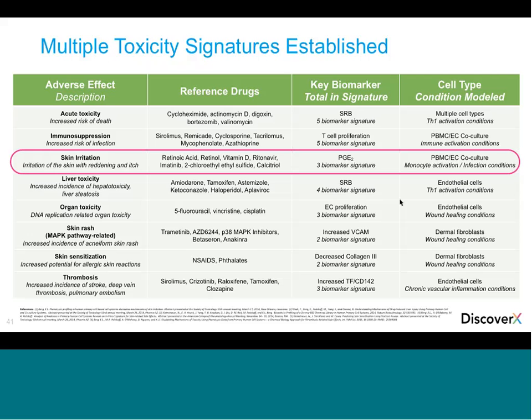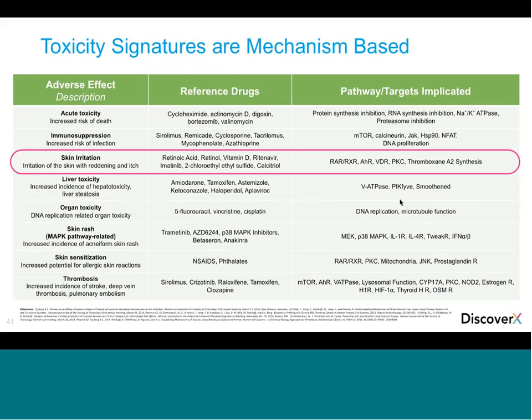And remember, not only do we have the signature and drugs that are associated with that signature, but we've also identified particular pathways and targets, mechanistic pathways that we've identified for each one of these signatures. So these are mechanism-based tox alerts.